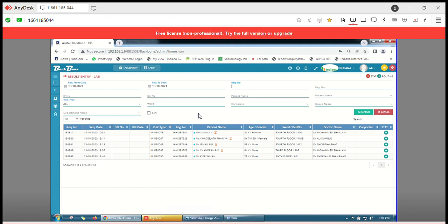If it is coming from the IP, you have to ensure that the request is generated in the HIS, and then they bring the book again, where the patient name and the tests are written. The HIS test and the book test should match each other. Once that is done, you take a barcode, stick it to their book and sign it, and then you stick the same thing into our book also and sign it. Once you have signed it and received the sample, everything is understood to be proper, and further testing can go ahead. So this is how IP samples are received in our lab. Okay, thank you.